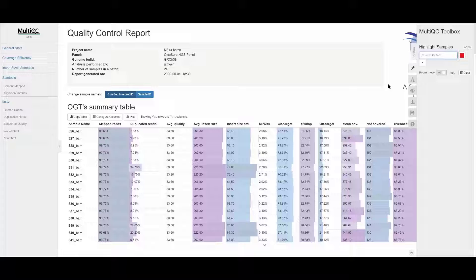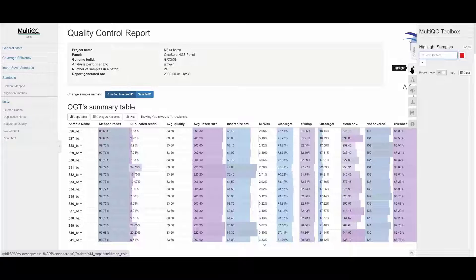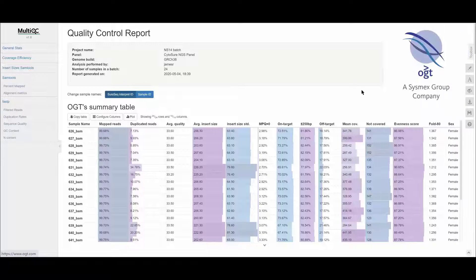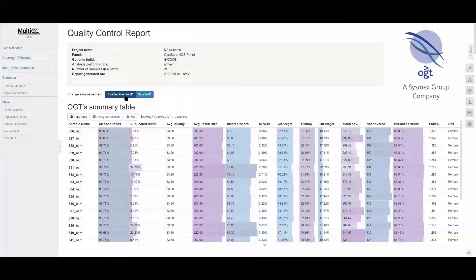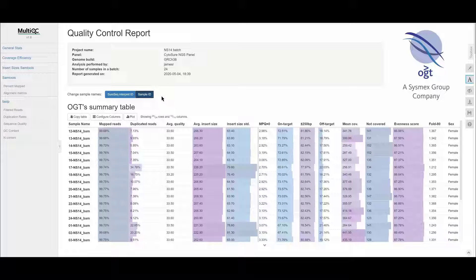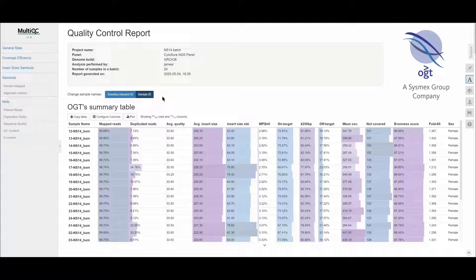You have an option to display the data using either the SureSeq Interpret ID number, which is a sequential number assigned to each sample analyzed in the software, or you can display the samples based on their actual sample ID.